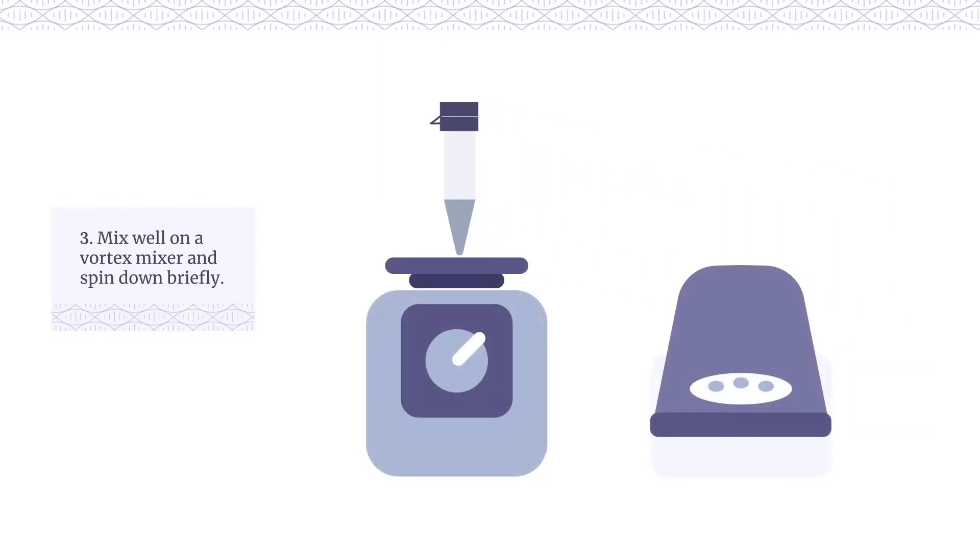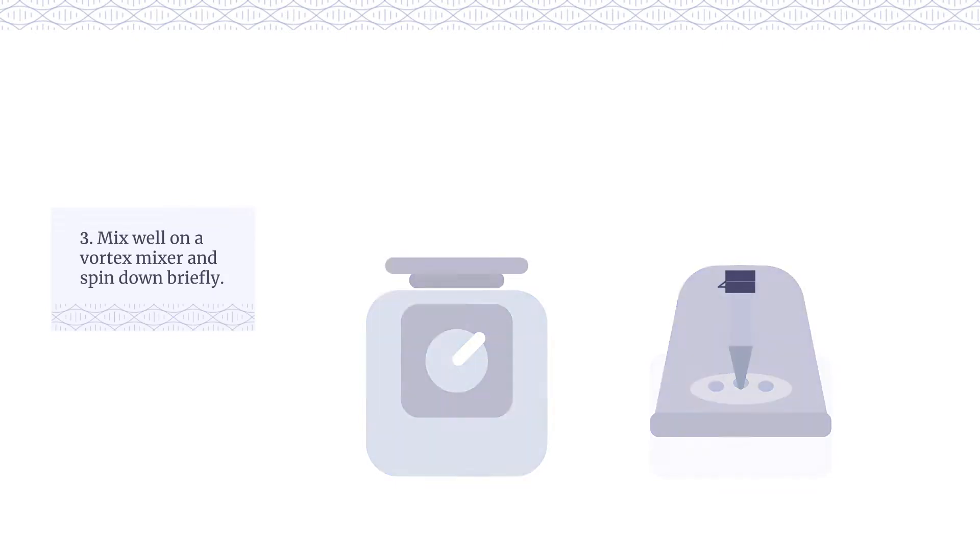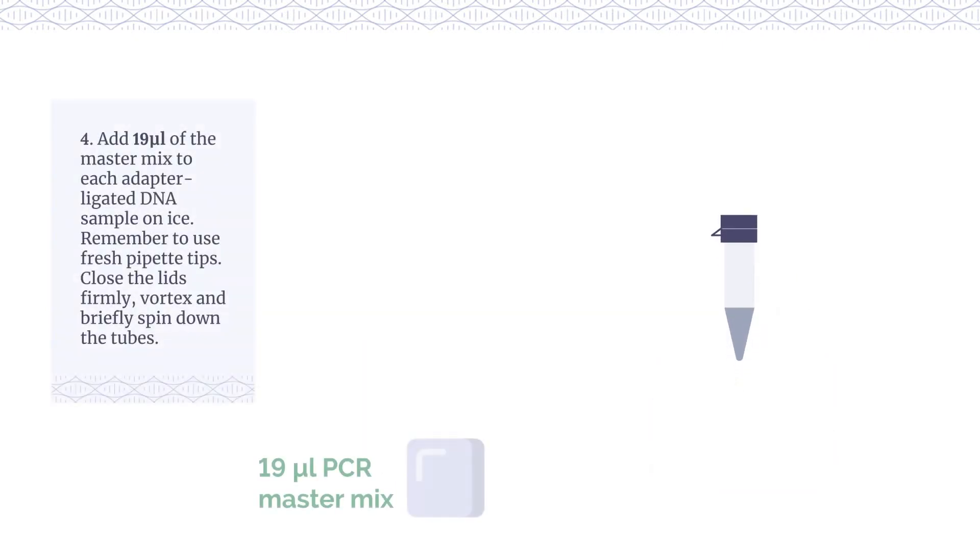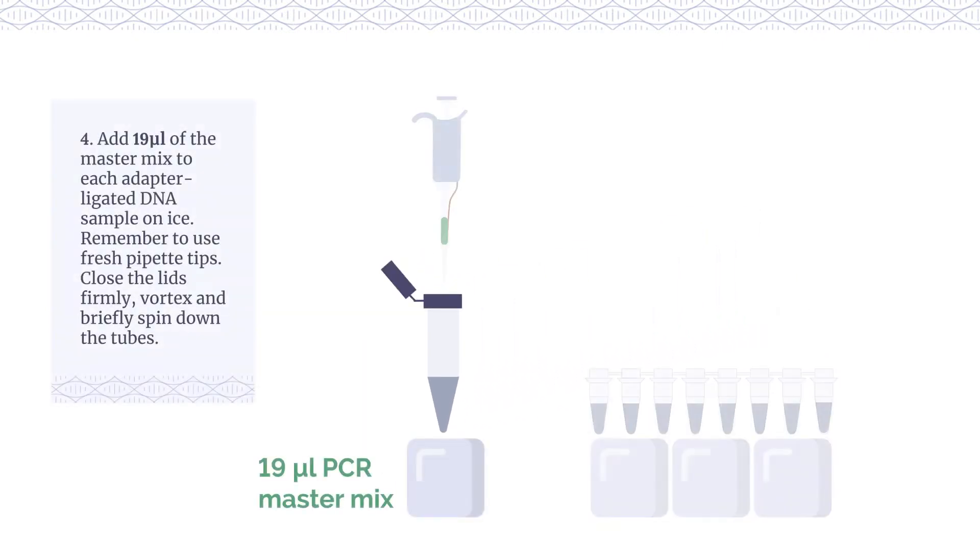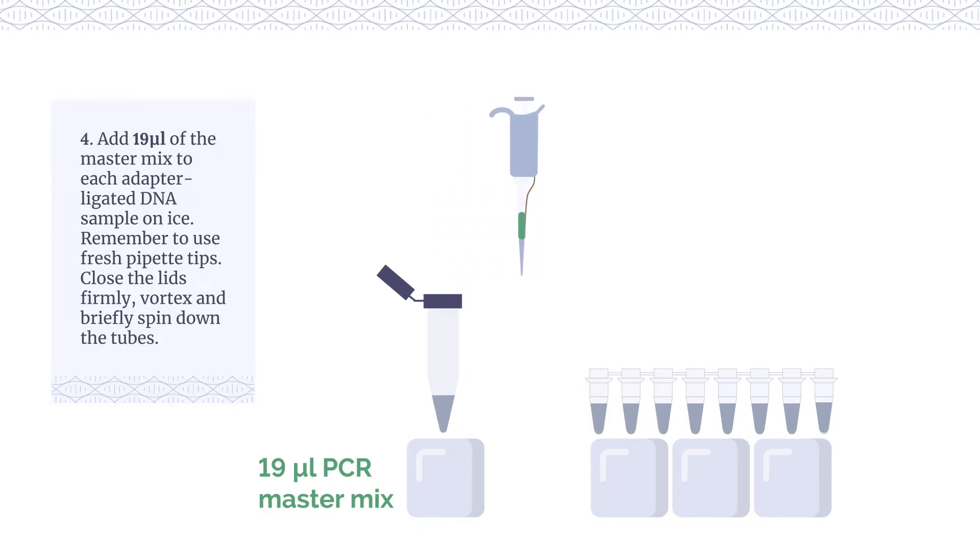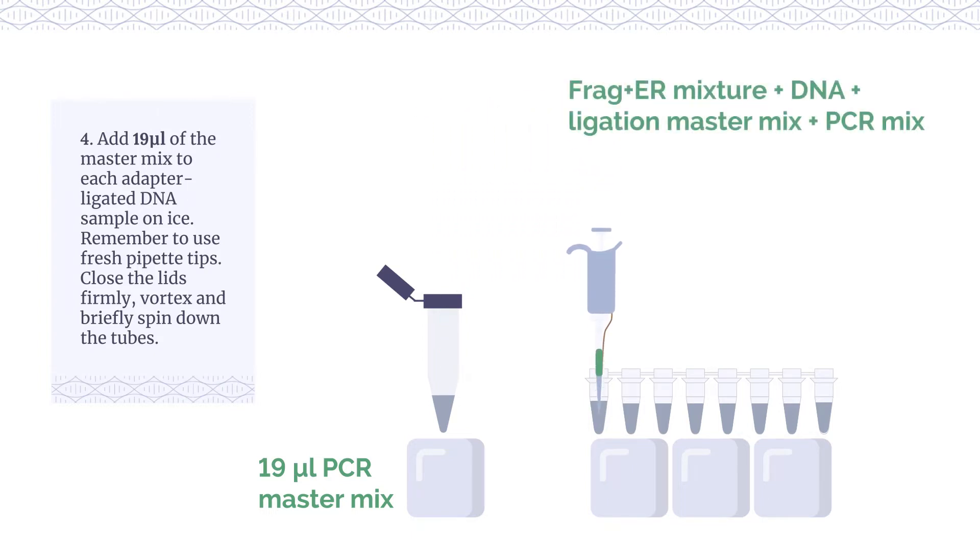Mix well on a vortex mixer and spin down briefly. Add 19 µL of the master mix to each adaptor ligated DNA sample on ice. Remember to use fresh pipette tips.